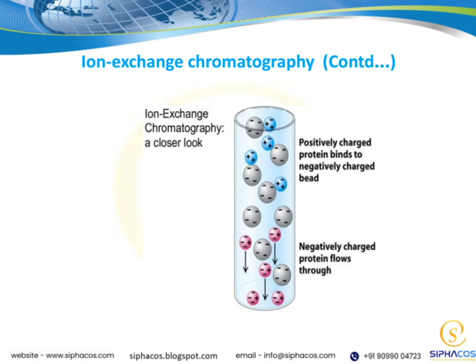Finally, connecting to the overall theme, understanding these principles helps us appreciate how ion exchange chromatography fits into the broader context of protein purification and analytical techniques. It's a technique that combines selectivity, efficiency, and scalability, making it indispensable in research and industry alike.